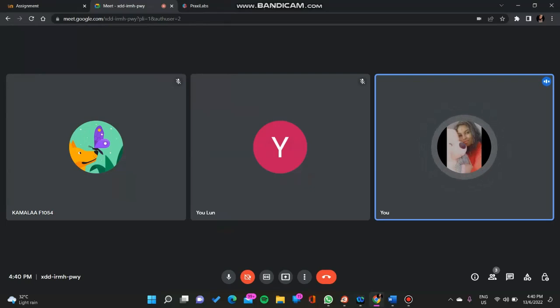Today, we are going to conduct experiment 5, that is the reactions of the aldehydes and ketones. We're going to use a simulator. The first simulator experiment will be conducted by Yulun. As he has a mic problem, I will be giving his voice over.